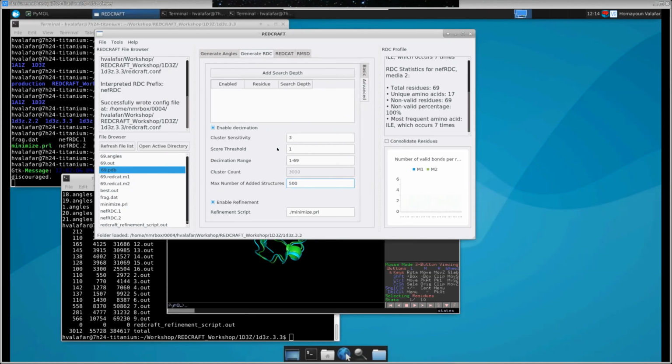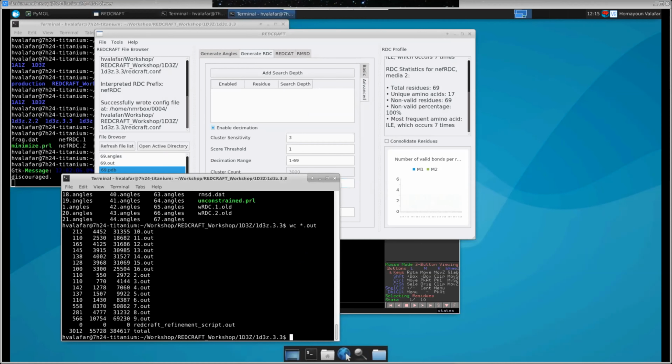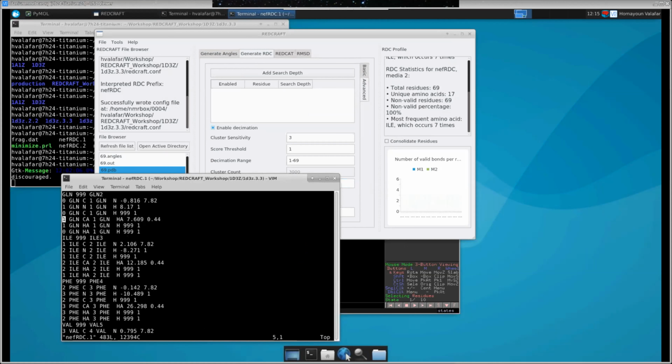So what's the impact of not providing the J? I'm sorry? In this real data, there are no J coupling values, compared to the synthetic ones. You had J also. Let me see, actually. So let's look. There were no J couplings in this particular data set, and I can confirm it this way: all the J couplings are 999, indicating no data.